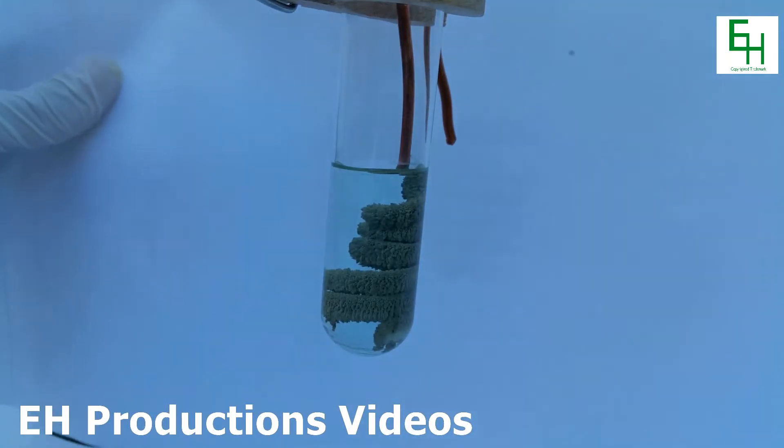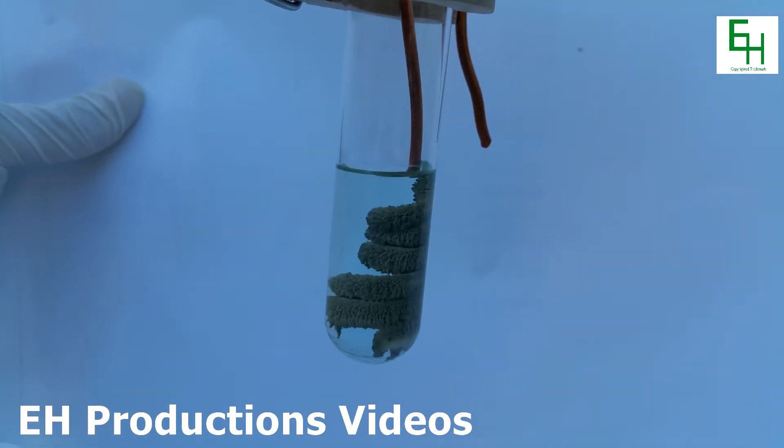Alright, here is the silver nitrate solution with the copper in it after about an hour. And as you can see, there are lots of crystals that are on there. Let me just turn that around. There you go.